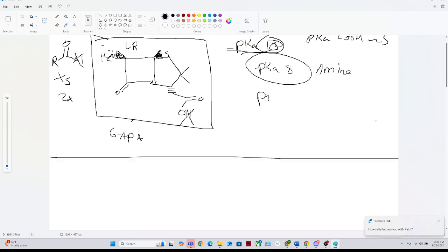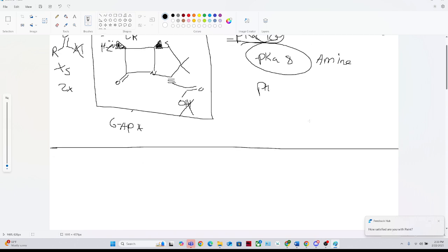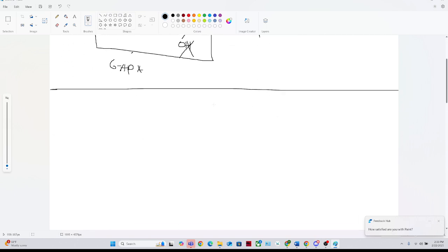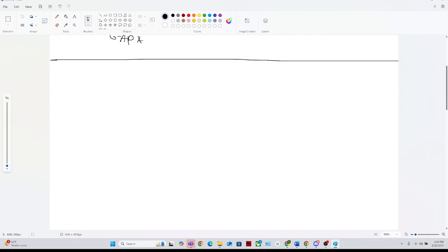So the reason that I said also that making the solution basic is a relatively important component is for the following reason. Typically, most reactions aren't perfect, so what is realistically going to happen is you're going to have two things, or a few things in your reaction mixture.